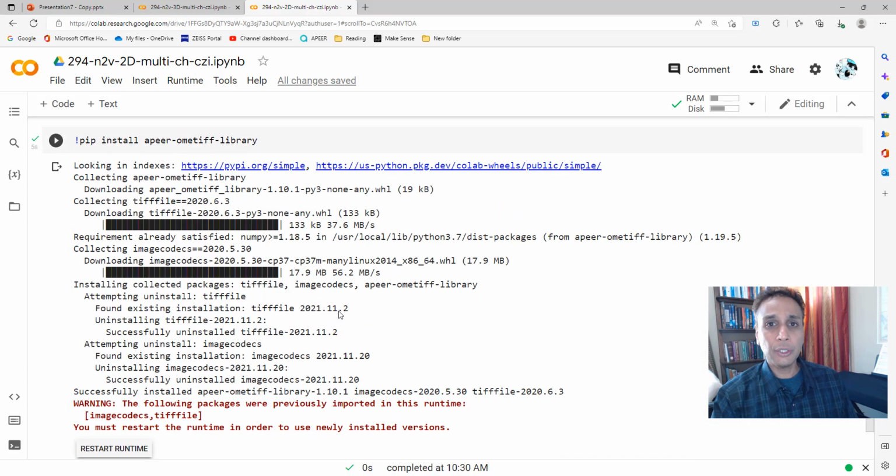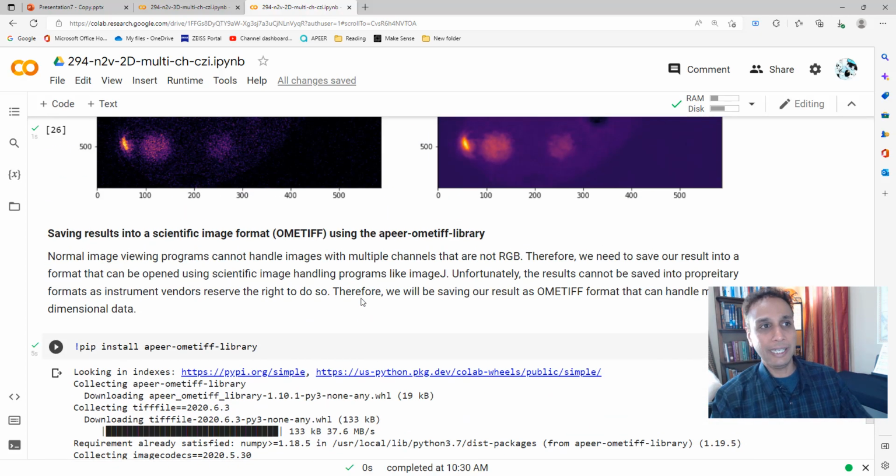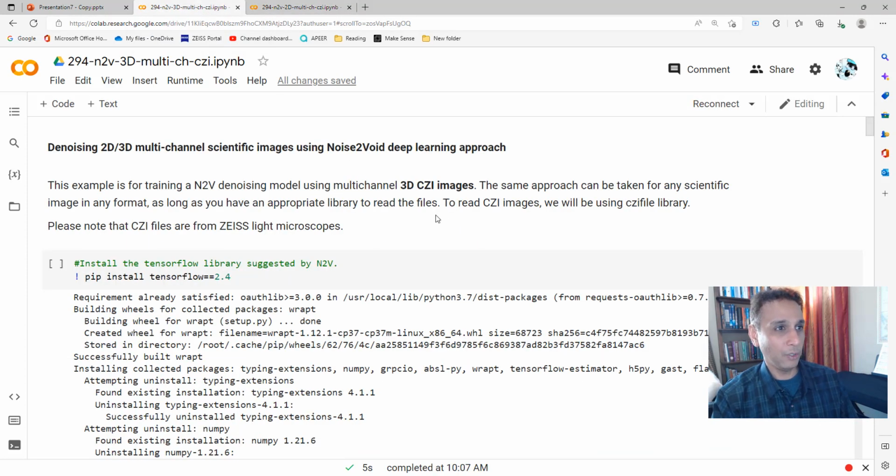Okay, now let's switch to 3D. I'm not going to go through 3D at this depth. I'll show you where the key differences are. I'm going to share both files with you, so of course you can play with them in your own time.